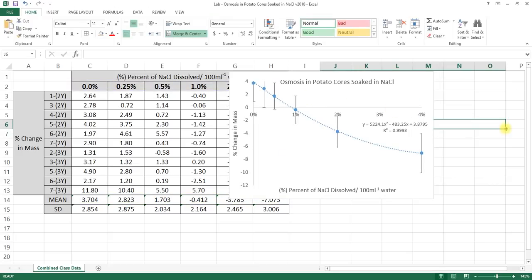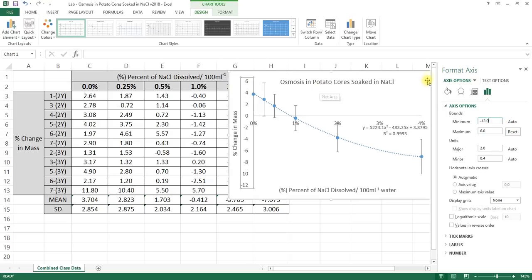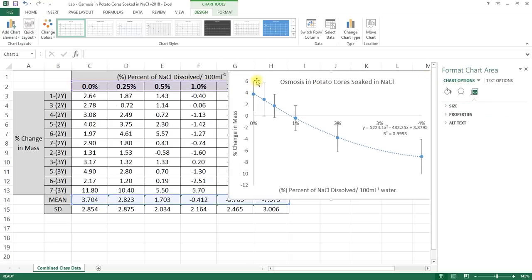Now our graph is looking a little bit better. But there's a couple things to take note of on our graph. It clearly pushed us off the screen, so we are going to have to go back and readjust our y-axis. Double click on this, and it looks like maybe we need to go back to 6 after all. So let's go ahead and put 6.0 in there. And let's see if that fits in our data. Nope, it's still too low because we want to get the top of that bar up there. Let's go ahead and do 7.0.